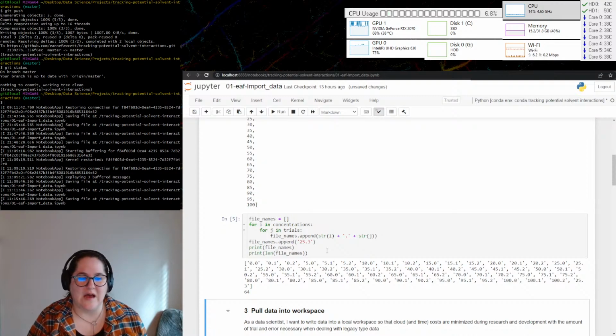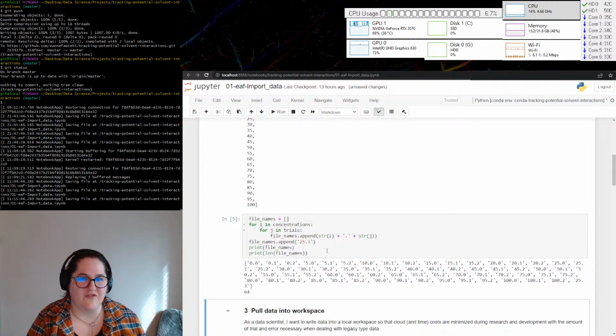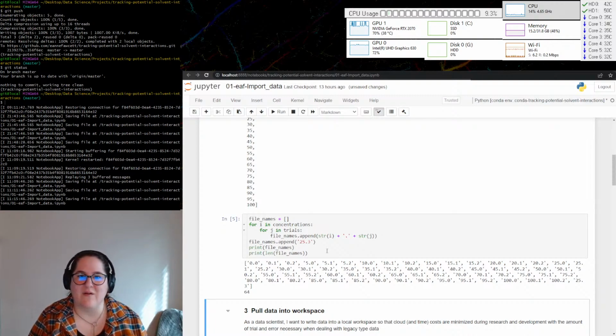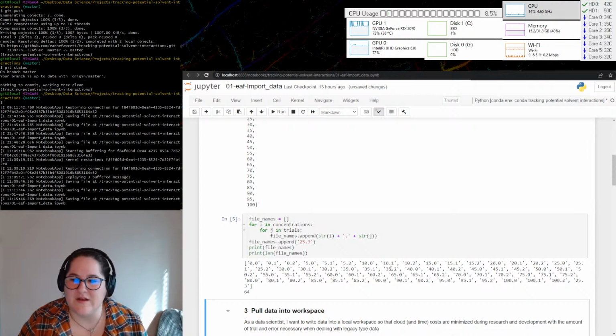That's a lot. They're not in one file, they're not consolidated. They're all in separate files. And a lot of times this is kind of what happens because we're running this instrument and then we're saving that file and moving on to the next run. There's not really a whole lot of parsing of information, right? It's just collecting it as much as we can and as fast as we can because a lot of times lab space is scheduled. So you want to do your information parsing later.